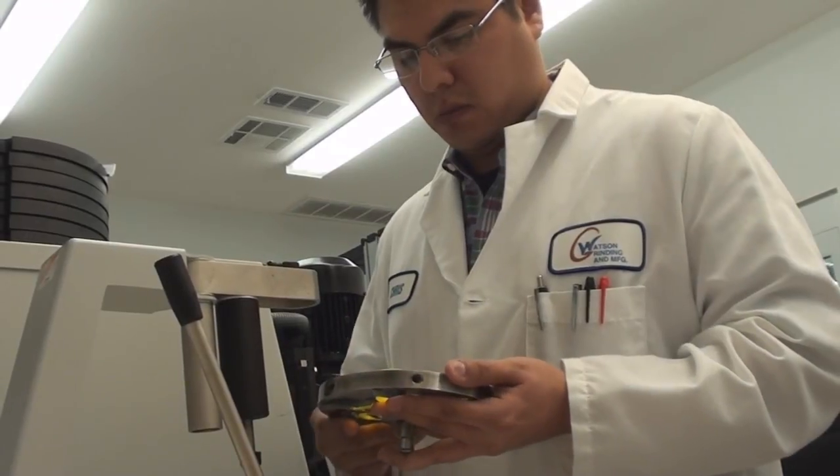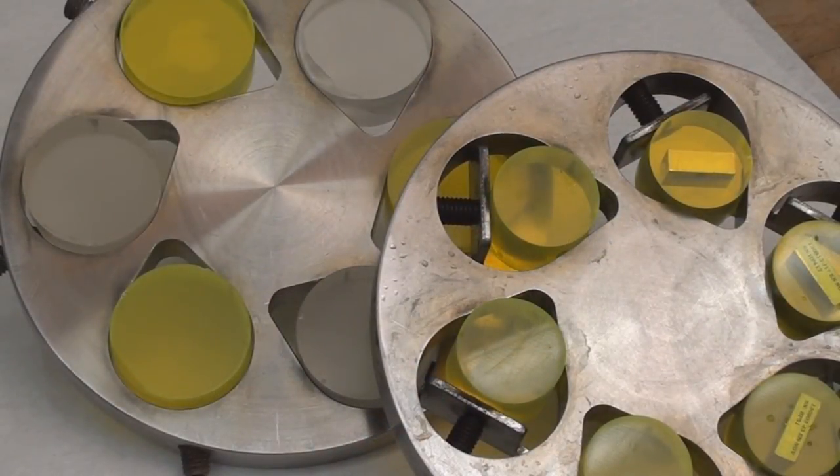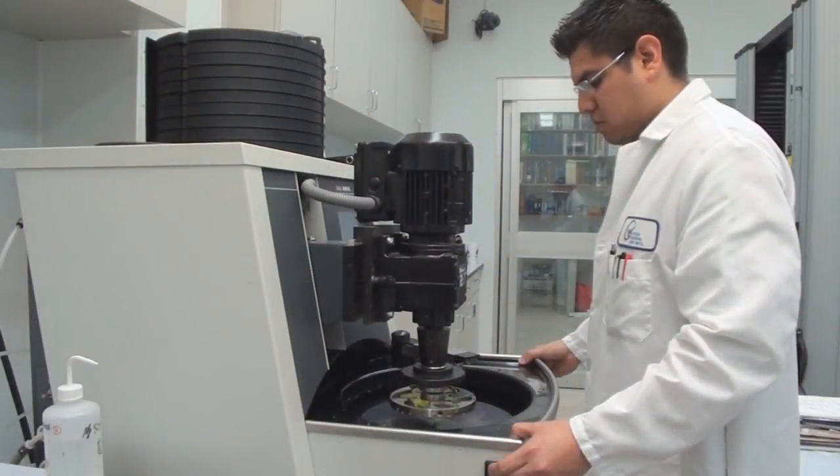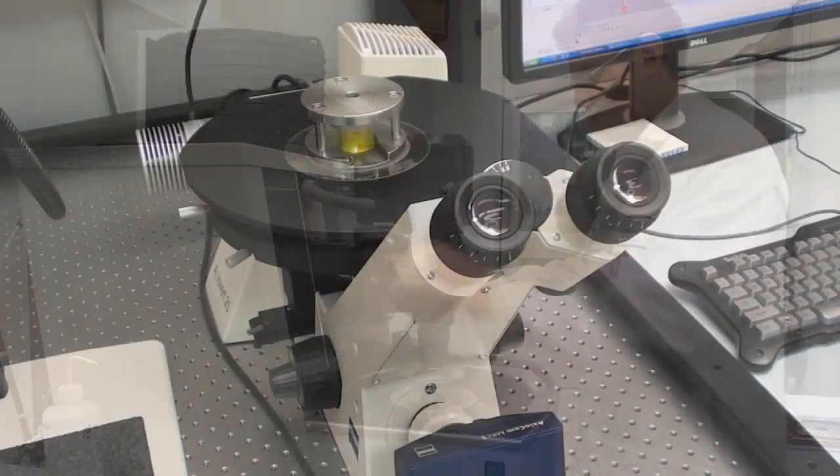In order to prepare the specimen for testing, we polish it to a precise level exposing a subsurface microstructure. We refer to this process as metallographic preparation. The exposed microstructure is then examined using a light optical microscope.